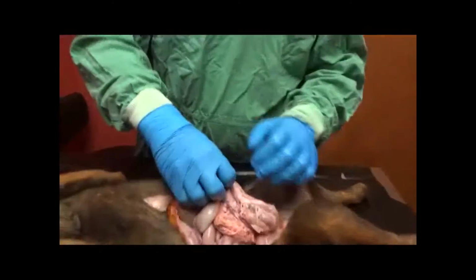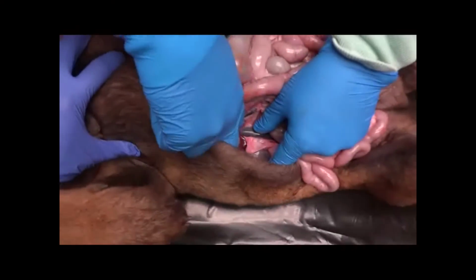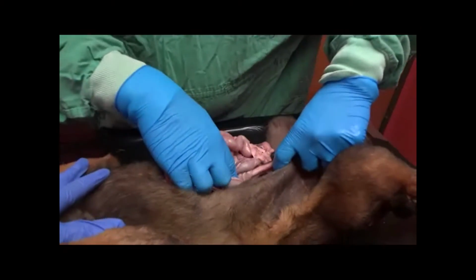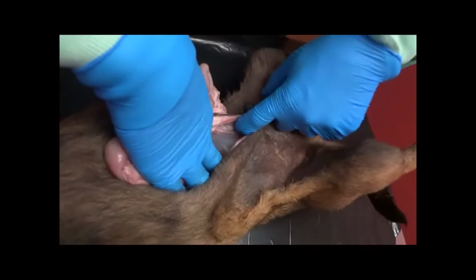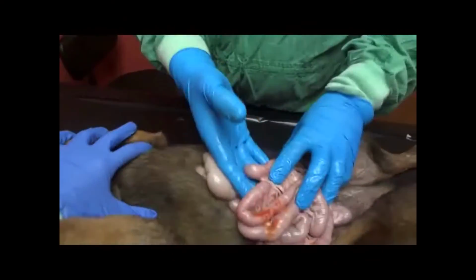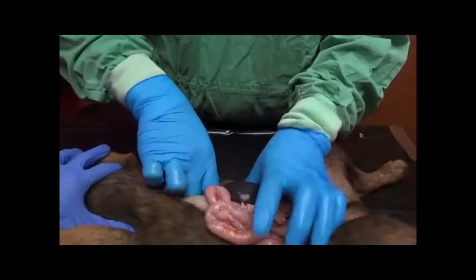So you would want to evaluate the right kidney as well, which is right down there. Go down. Urinary bladder, if we can find it. There it is. It's actually got some urine in it. A lot of times you could take urine from that as well. So that's the extent of the abdominal portion of the necropsy.